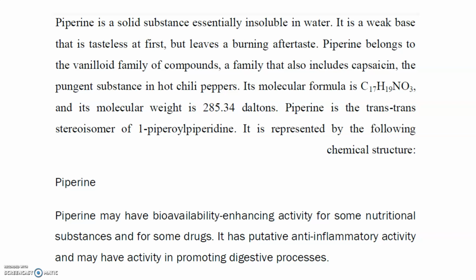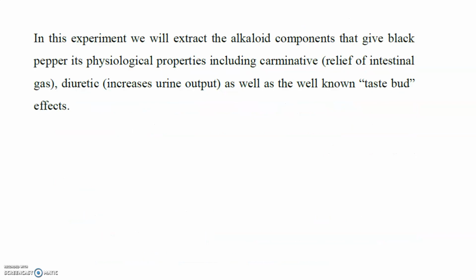Piperine may have bioavailability enhancing activity for some nutritional substances and for some drugs, and it has putative anti-inflammatory activity and may have activity in promoting the digestive process. In this experiment we will extract the alkaloid component that gives black pepper its physiological properties, including carminative effects, relief of intestinal gas, diuretic effects, increased urine output, as well as the well-known taste bud effects.